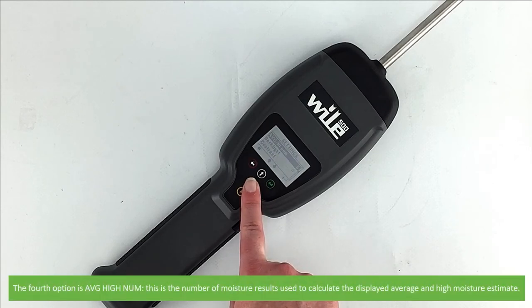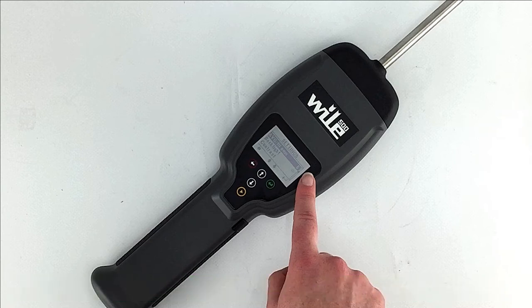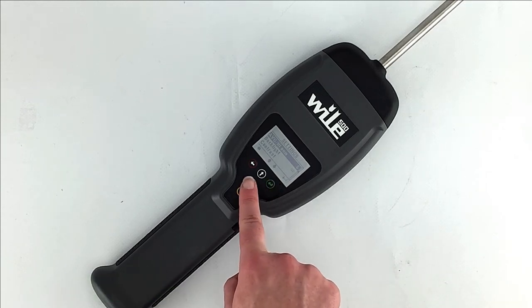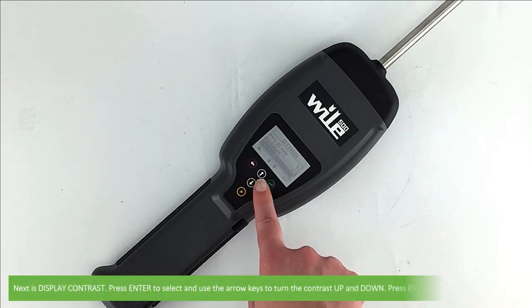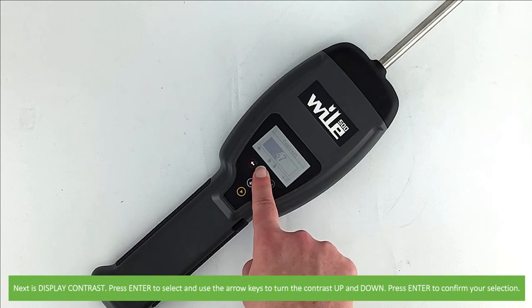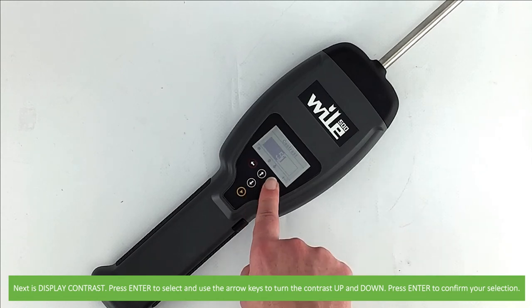The fourth option is average high number — this is the number of moisture results used in the calculation of the displayed average and high moisture estimate; press enter to cycle through the options. Next is backlight — press enter to switch the backlight on or off. Next is display contrast — press enter to select, then use the up and down arrow keys to turn the contrast up or down, and press enter to confirm your selection.